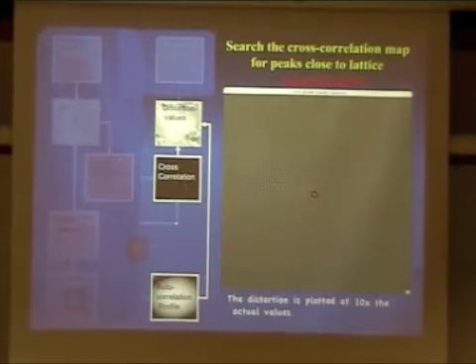Right. So actually, the other question then is, it's not a perfectly round profile, the autocorrelation profile. Now, if you've got a distorted crystal, which has a shift and a rotational shift within the crystal itself, does that cause problems? This kind of search is only able to handle shifts, not rotations. So if within a crystal there are rotations, this sort of distortion correction will do nothing.